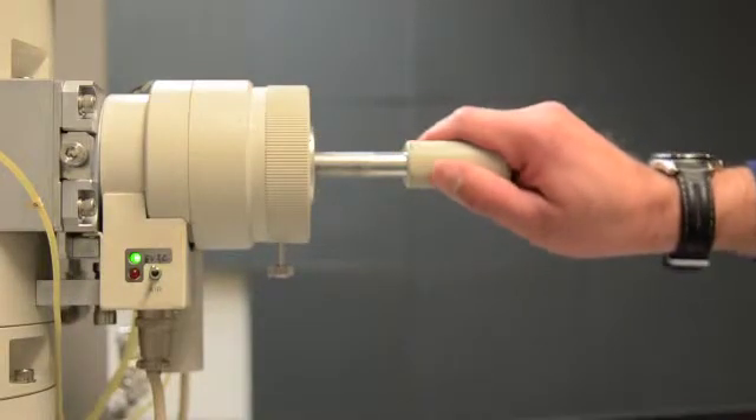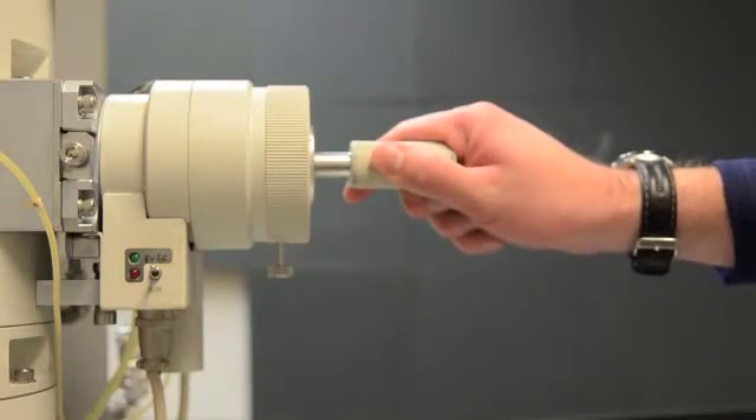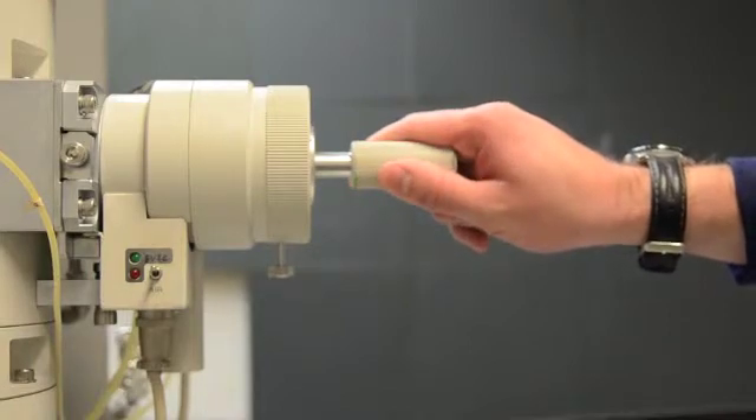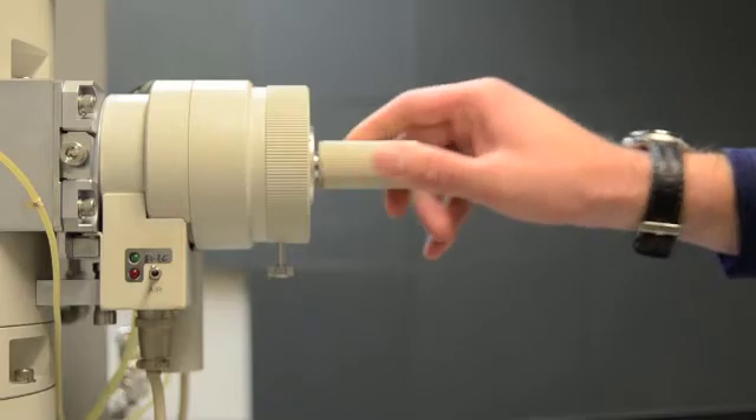Rotate the rod clockwise and allow the rod to slowly enter the stage and come to rest in position B. Then rotate the rod counterclockwise and allow it to slowly enter the column in position C. The sample is now in the electron beam path.